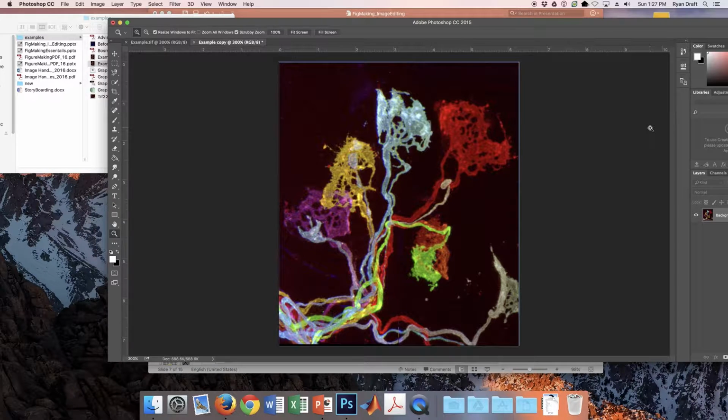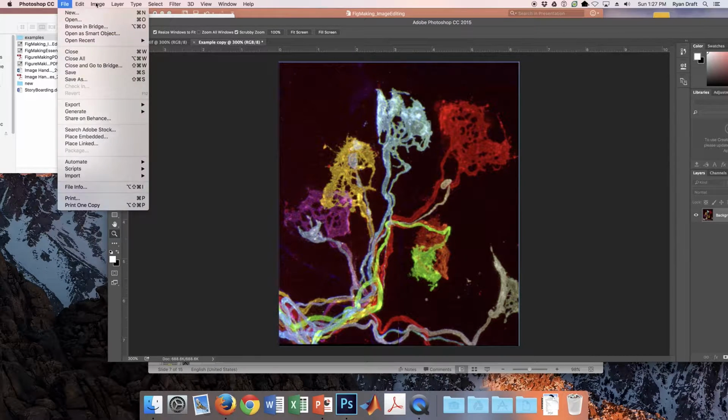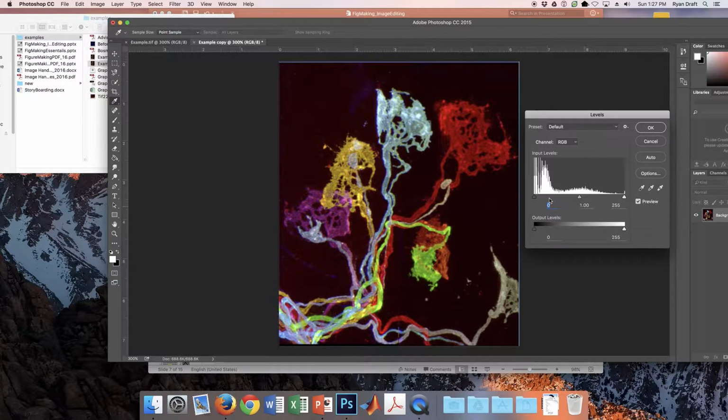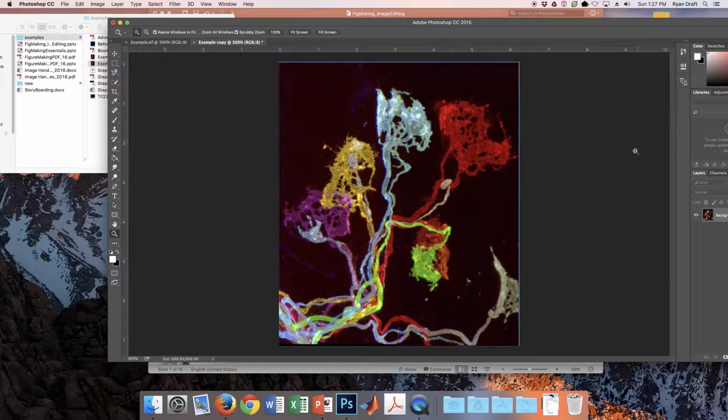This is a permanent alteration of the image, so if we go back and look at the histogram after I click OK, you can see that now the histograms get redrawn according to these new endpoints and gamma values. So be sure you have your original image unmodified so that if you don't like it or it becomes problematic, you can always switch back to the original.